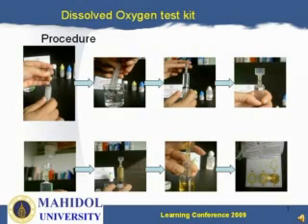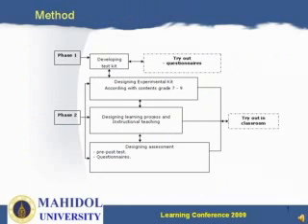Step 5. Transfer the solution into the glass bottle up to the line. Look from above through the solution. Match the color of the solution with the standard color scale. Read the value. This shows the procedure for designing and testing experimental kits.